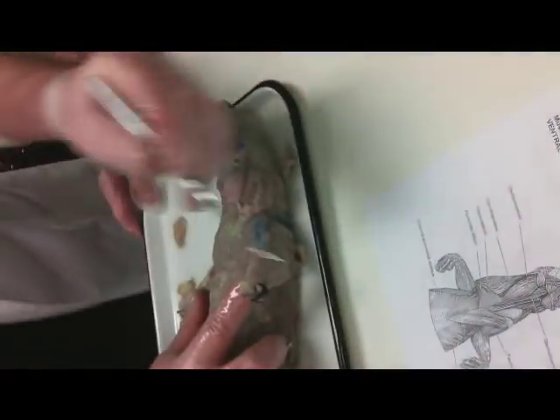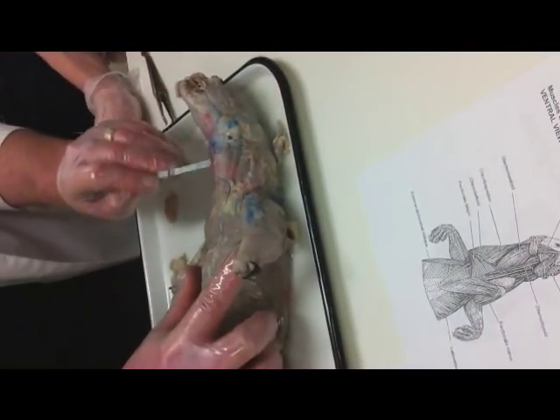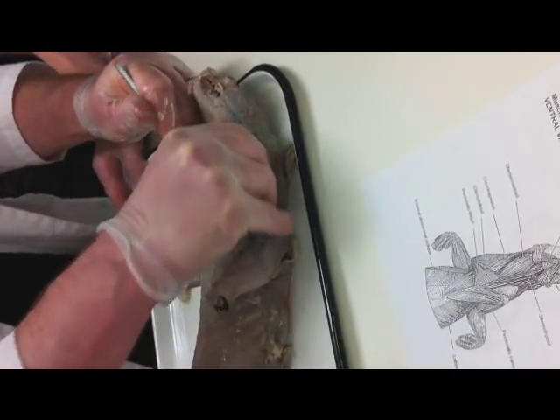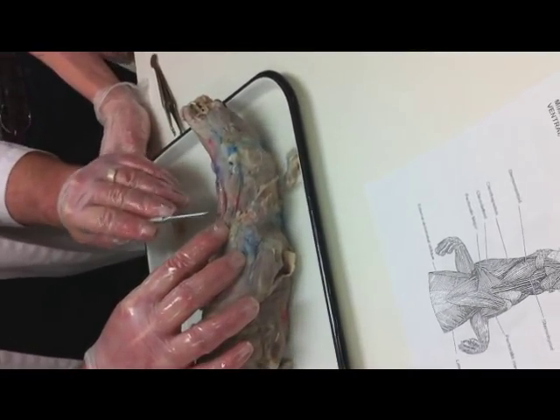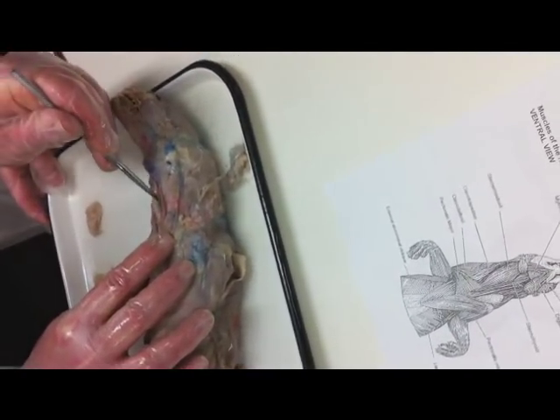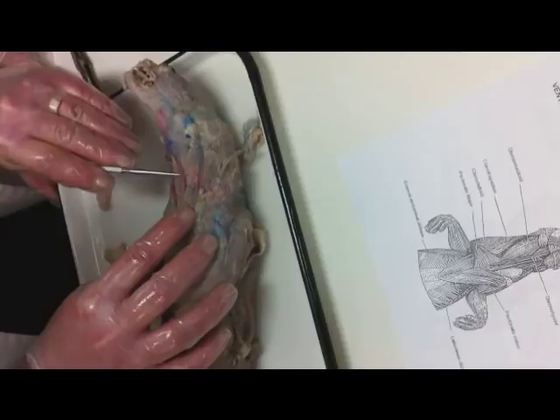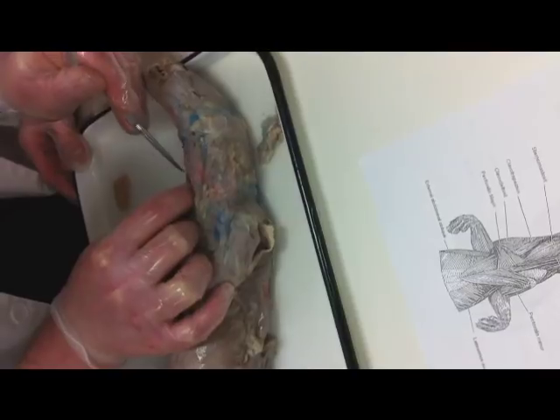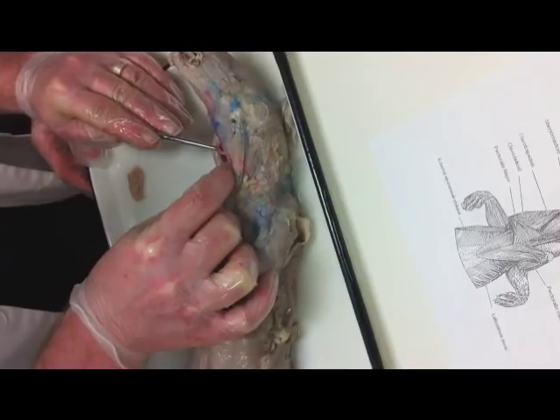Okay? Now, to get to the other muscles on the other side, because it shows them cut away, you actually have to tear the sternomastoid a little further apart. So what I'm going to do with this guy is get in here and tear the sternomastoid down a little further, and in doing so, I'm going to expose his trachea, his windpipe. See that? Okay, that's his trachea. And as I reach and probe underneath of it, his esophagus is attached directly to his trachea. There it is, right there.